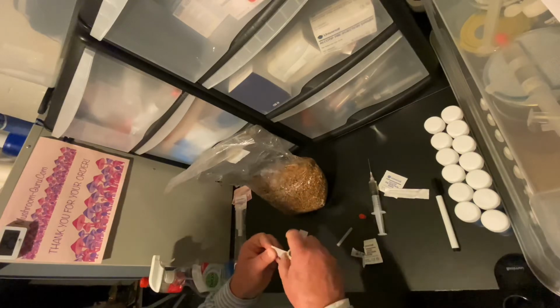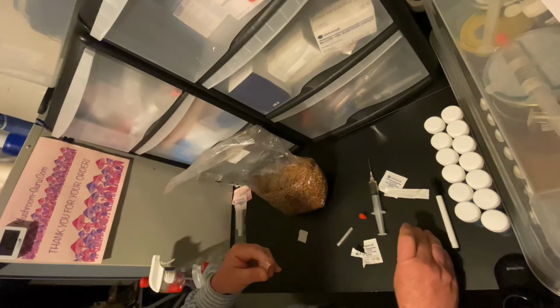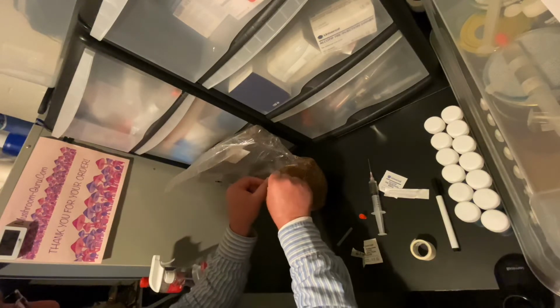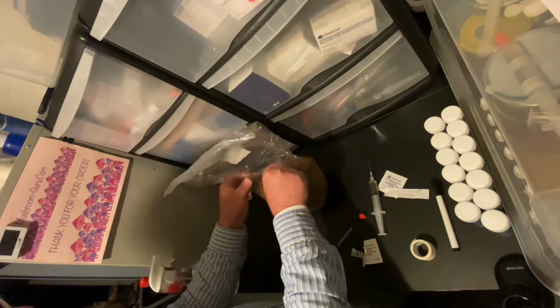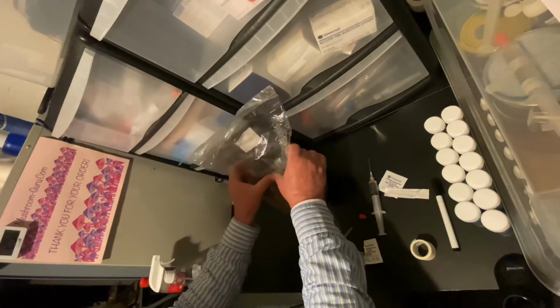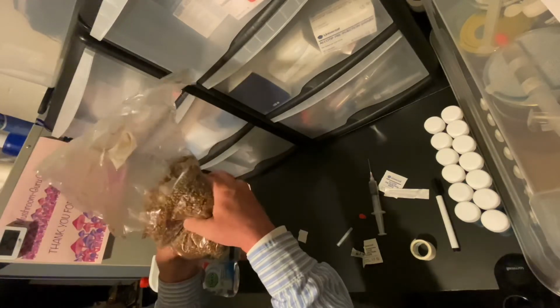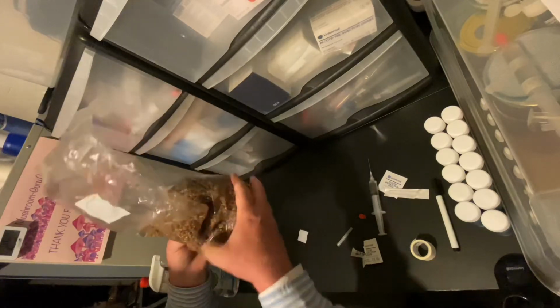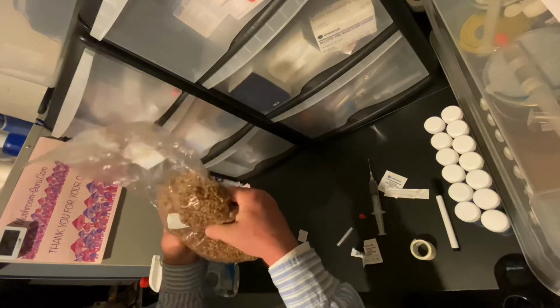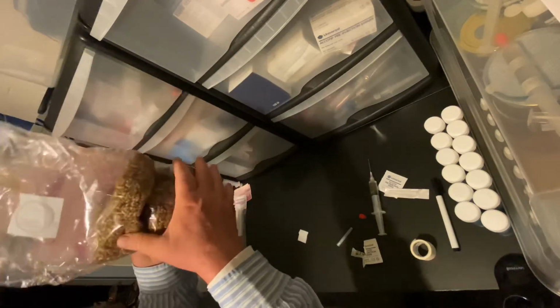Okay, now after you've done that, I use micropore tape. You can also use normal tape if you want, and you just cover the hole where you inserted the needle, and that's it, done. And I like to spread it up a little bit so that we get more attacking points for the mycelium, and then it should spread all over the bag.